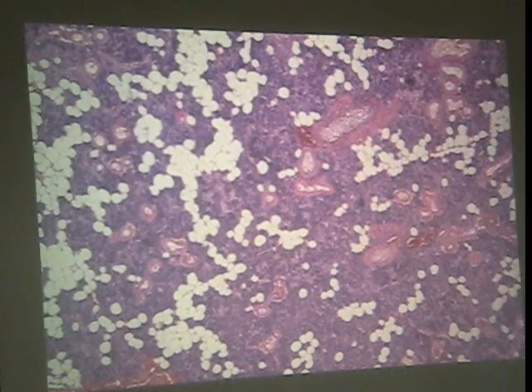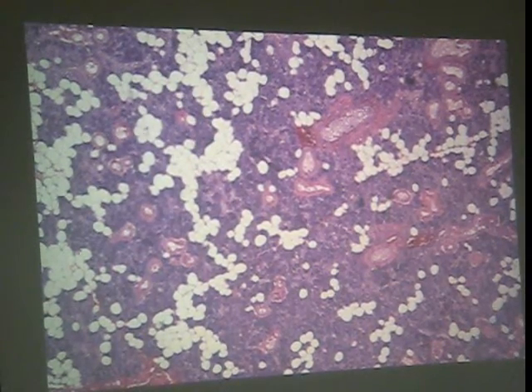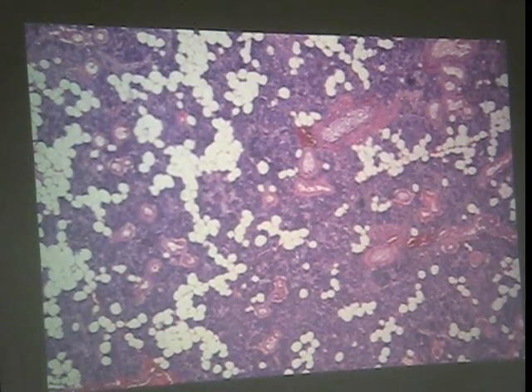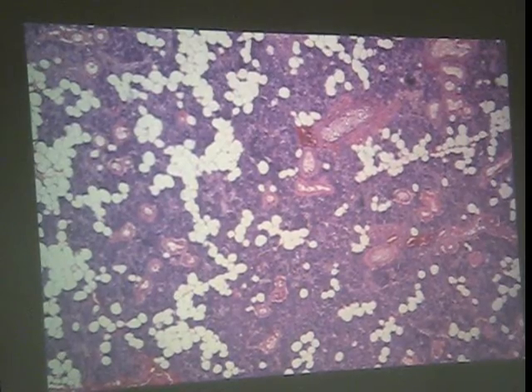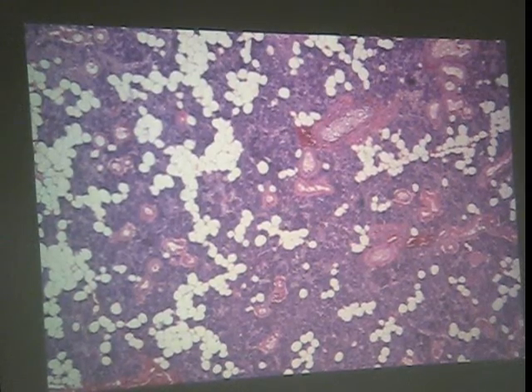How do you know? Serous acini, well, ducts, which tells you it's an exocrine gland, serous acini. But if you come across something like this, make sure you search the whole section, right? Because as you remember, the seromucous acini or the mucus acini in the submandibular gland can, until you get your search image squared away, kind of be like they're hiding from you, all right? But you're right, parotid gland.